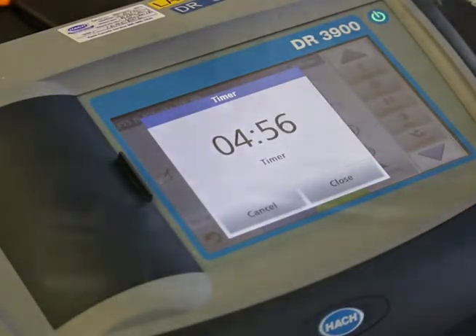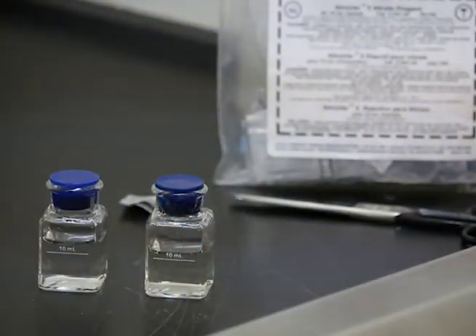Start a timer for 5 minutes. An amber color will develop if nitrate is present.